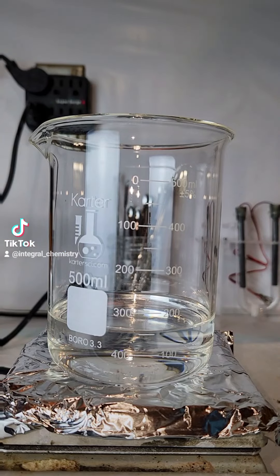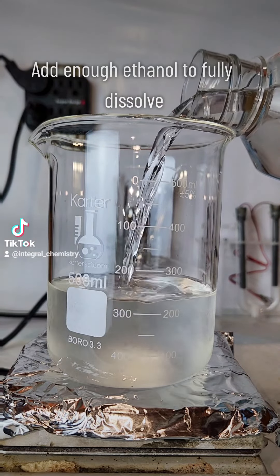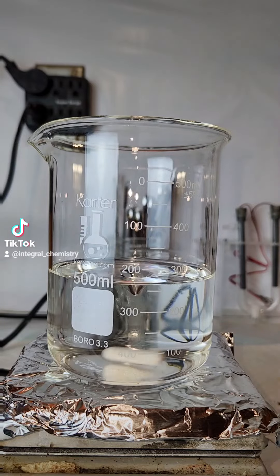To start, I first add all of my liquid products to a 500ml beaker, beginning with the chloroform, then ethanol to dissolve the chloroform, and finally my hydrochloric acid, which is added in small amounts.